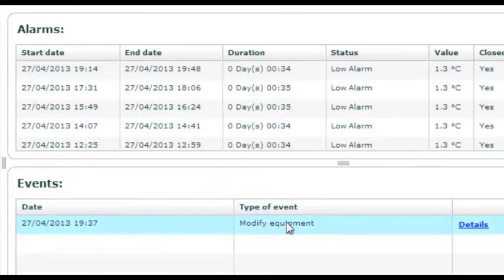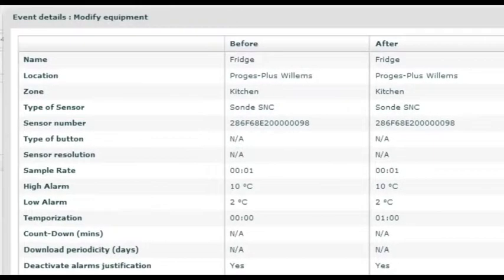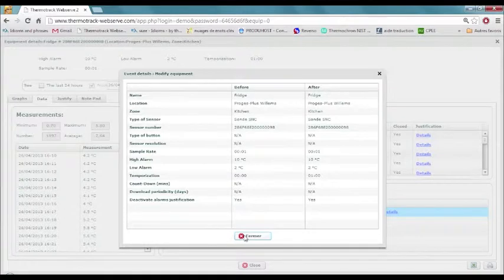To comply with the CFR 21 part 11 of the FDA, we keep a track of all changes that have been made. This is the audit trail. You can at any time check what have been modified and by whom.